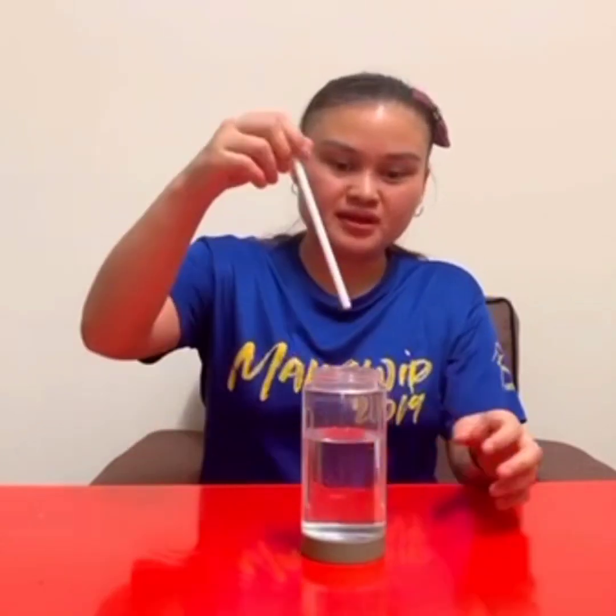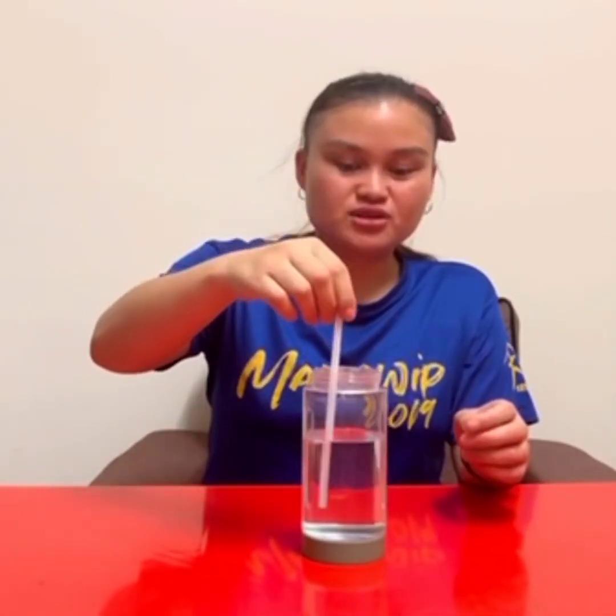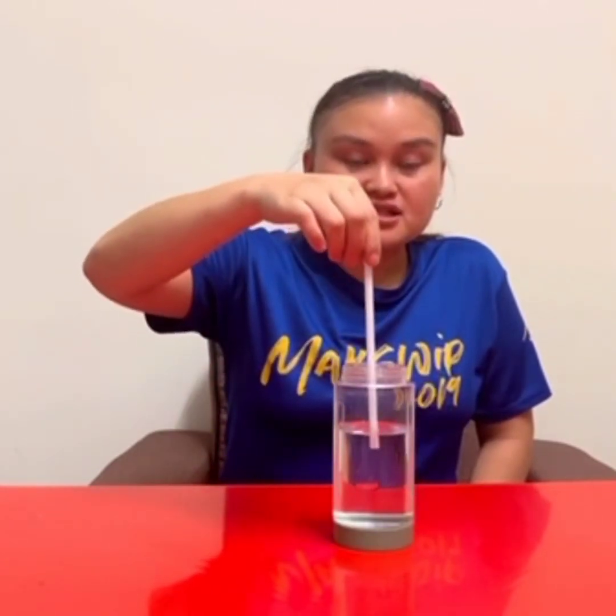My name is Azni Linus and today I will show the procedure of the alkalinity test. First, rinse the pH electrode and a 150 ml beaker with distilled water. This is a rod, an electric rod. Transfer 100 ml water sample into the beaker. Dip the pH electrode into the beaker. Stir the sample with a magnetic stirrer. Be sure that the pH electrode tip is near the beaker bottom without touching the rotating magnetic stirrer.